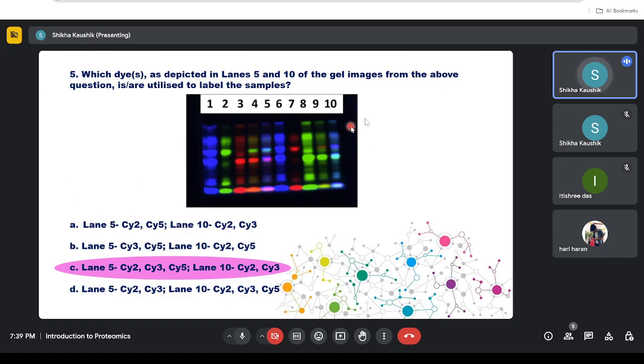बट ग्रीन भी है, ये देखना था, यही इसका कैच है, because you have a green effect here in this particular region. See, right? The blue is getting shifted towards the lighter blues. That is because of green.